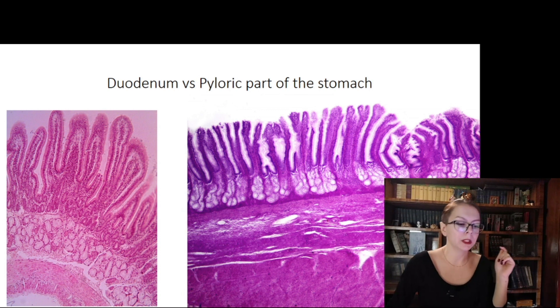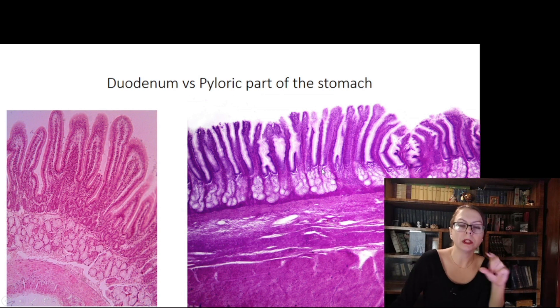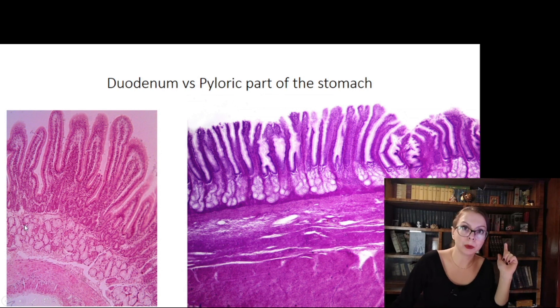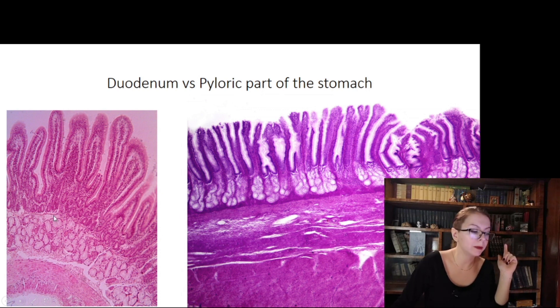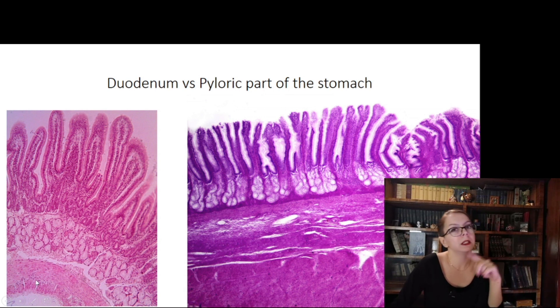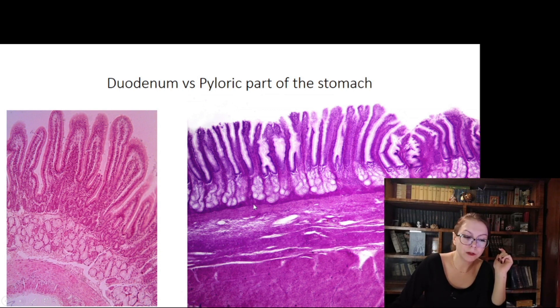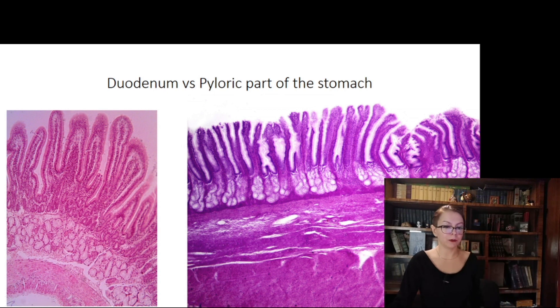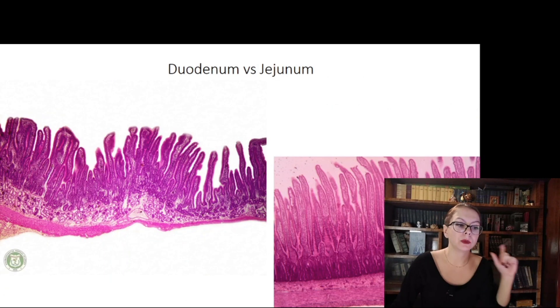The second criterion is the location of the glands. In the pyloric part of the stomach, glands are located in the lamina propria, while in the duodenum they are located in the submucosa. Notice that here the lamina propria is occupied by crypts, with the muscularis mucosae in between, and only after that come the glands — which are in contact with the muscularis. In the pyloric part, between the muscularis and the glands there is loose connective tissue of the submucosa.